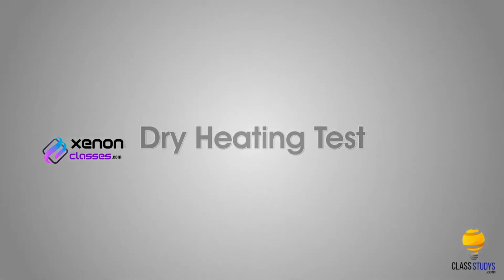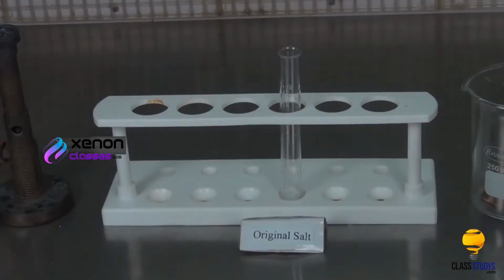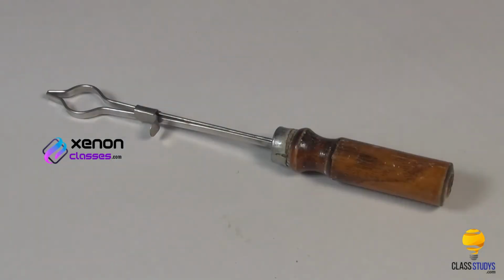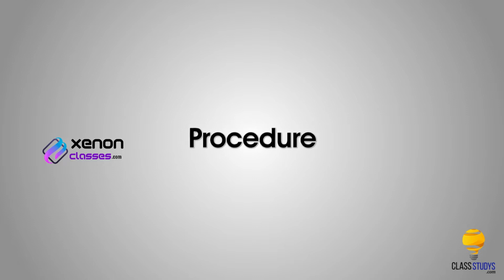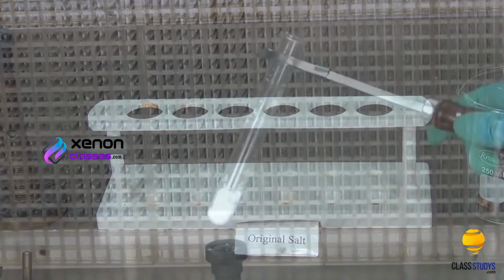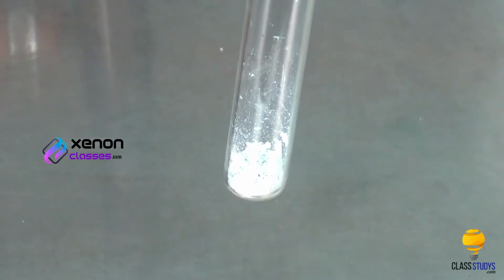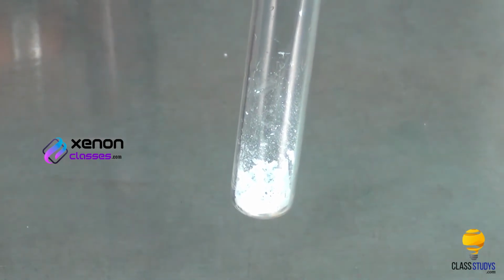Dry heating test. Materials required: original salt in a test tube holder, and Bunsen burner. Procedure: take a small quantity of salt in a test tube. Heat it over the Bunsen burner. A white residue glows on heating, which indicates the presence of calcium ions.